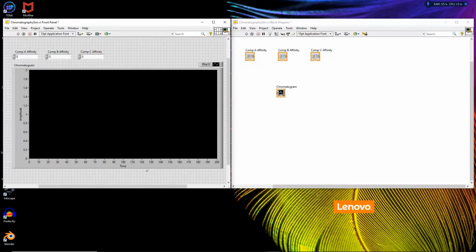In fact, I just didn't even read my own instructions. It says right there, right-click on the y-axis and set the marker spacing to arbitrary. Okay, marker spacing arbitrary. Cool. And then right-click on the x-axis and set the marker spacing to uniform. This will display the scale markings on the bottom of the graph. There you go. Fantastic. That's exactly what I wanted. I should have read my own freaking directions. It should look similar to the picture, and it sure does. That's fantastic. Switch to the block diagram.